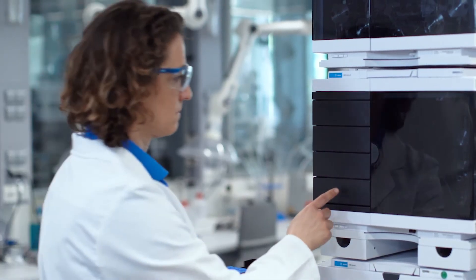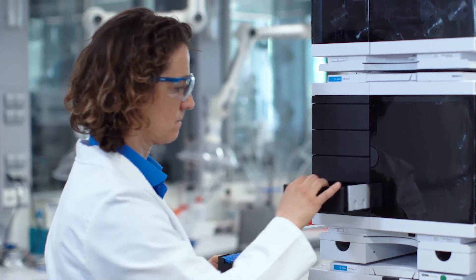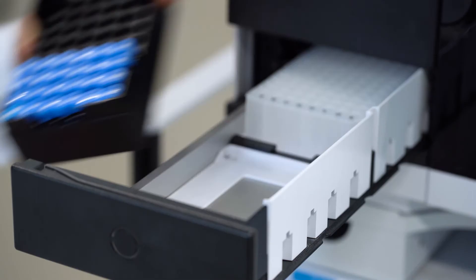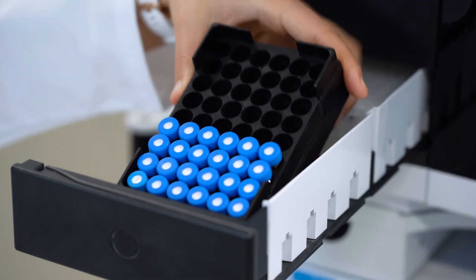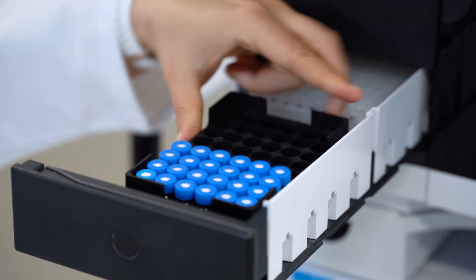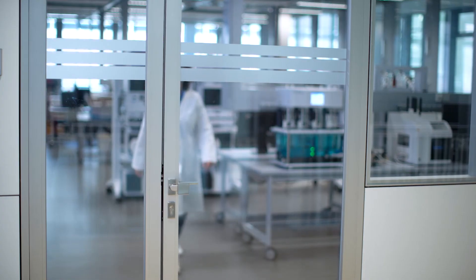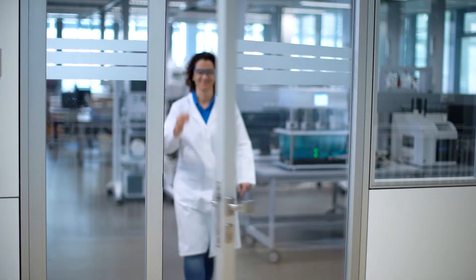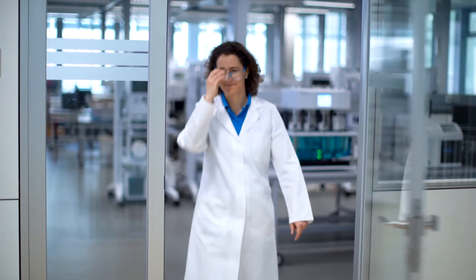Simplify nanoparticle dissolution testing and get new drug products to market faster with the Agilent NanoDisc system.